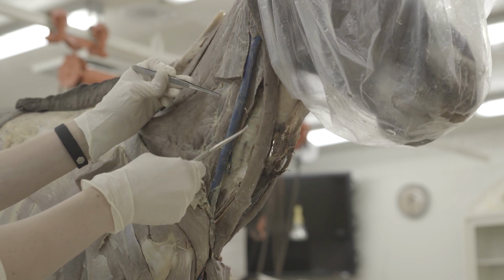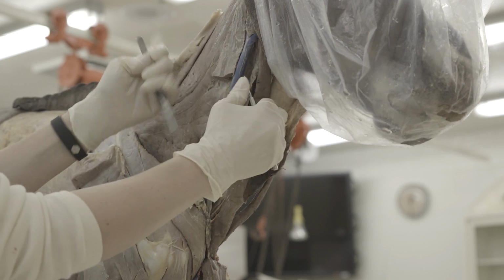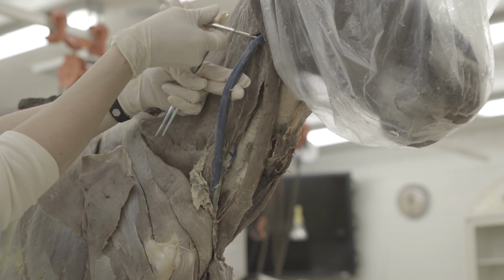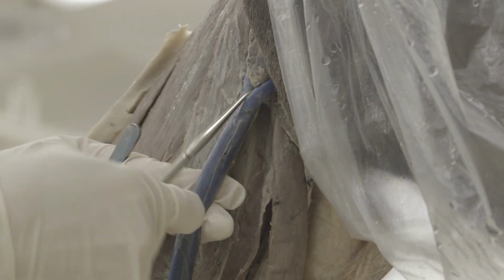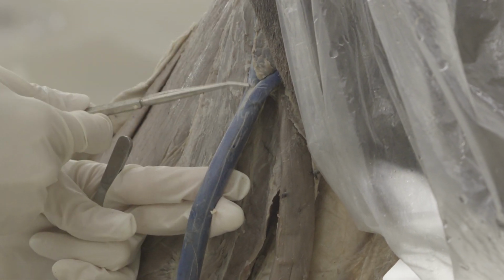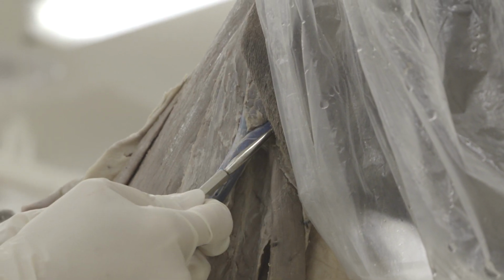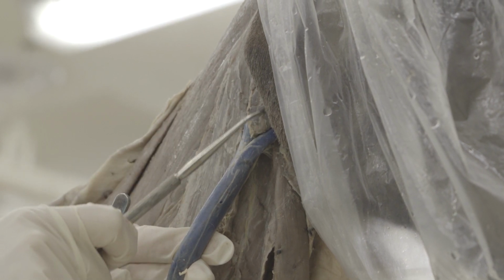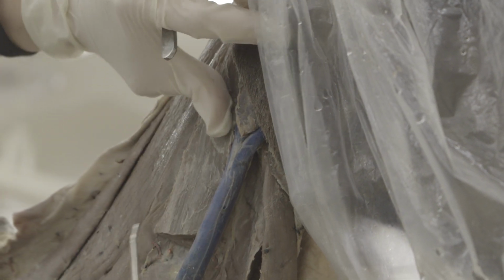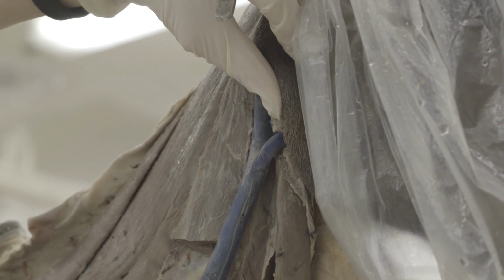Then if you trace your external jugular vein up towards the head, you want to find where it branches. So it has the branch that's the linguofacial branch, which will be this branch right here. And then the maxillary branch, which goes up toward the head. So maxillary going up toward the head and linguofacial going transversely across here. In between those two branches, you have this parotid salivary gland that you can see part of. And you have to reflect that slightly to be able to see the tendon of that sternomandibularis muscle that we're going to talk about next.